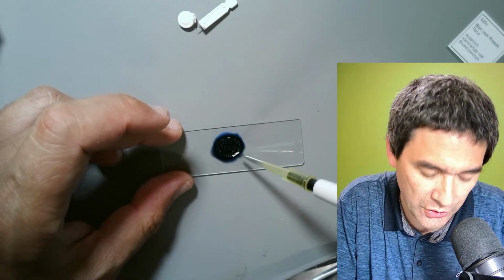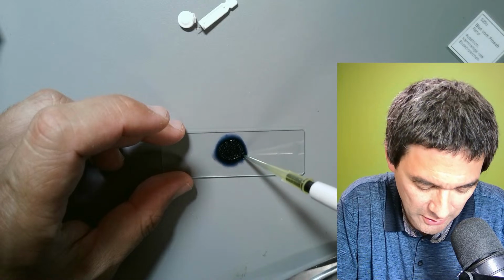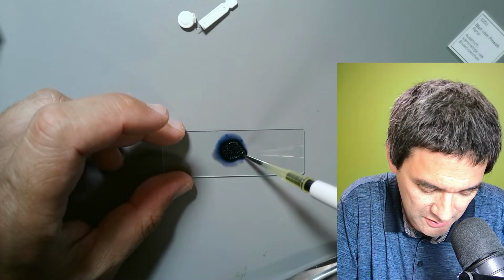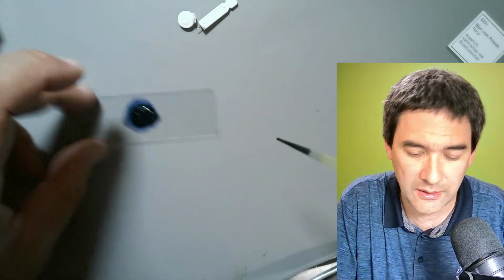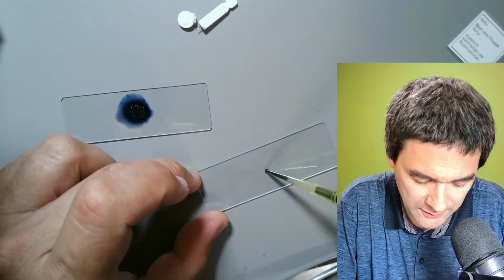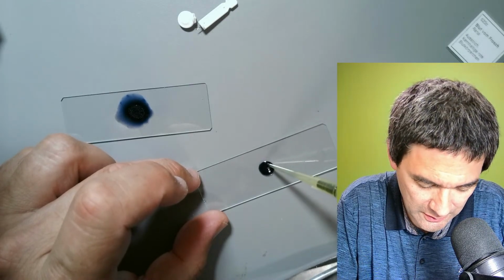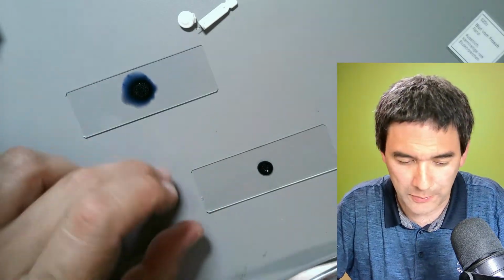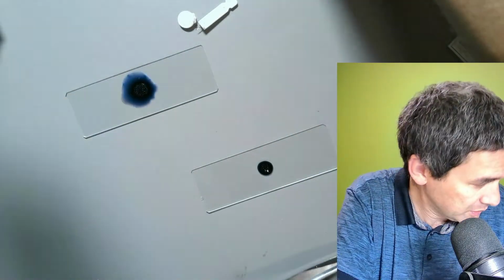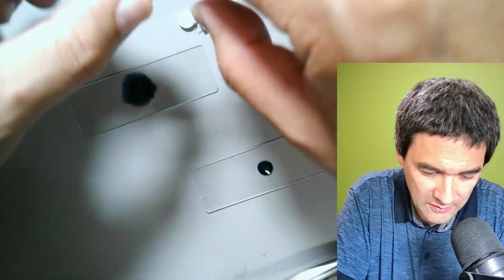See, that's actually not a good idea. Now I've got some foam bubbles forming. Okay, so what I'm going to do, maybe I'm just going to take some of this here, like this, and put it on a new slide without foam. And the cover glass goes on top again. Should I use a smaller one? I think I'm just going to use a smaller cover glass. This one over here.